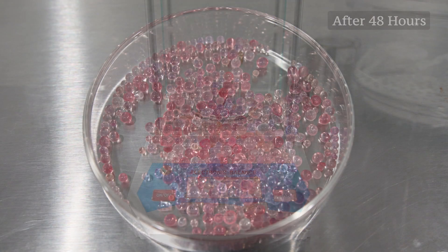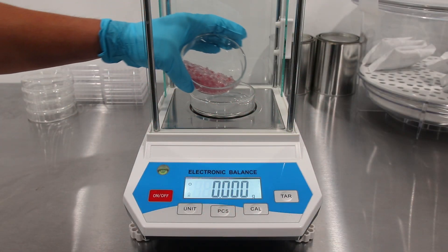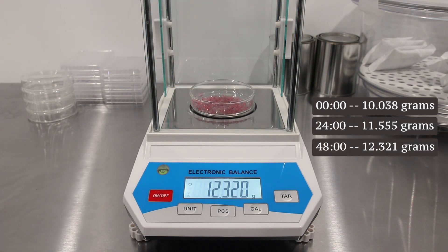After 48 hours the silica gel has fully transformed to a pink hue. Now let's proceed with the weight measurement. The updated weight is 12.321 grams.